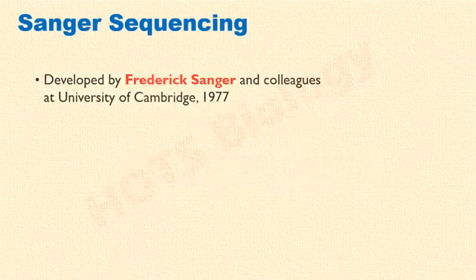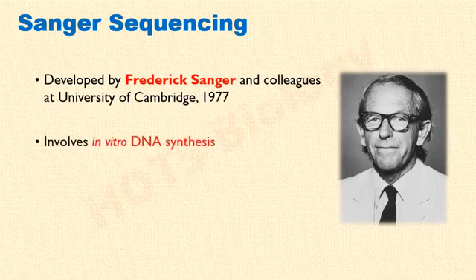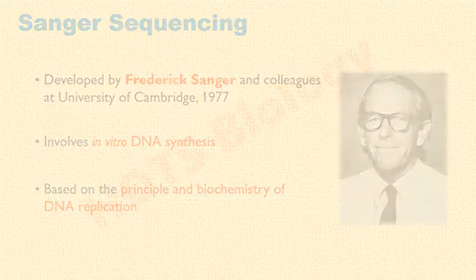Sanger sequencing was developed by Frederick Sanger and colleagues at the University of Cambridge in 1977. This technique involves in vitro DNA synthesis. It is based on the principle and biochemistry of DNA replication. Tell me, what will be the basic requirements for in vitro DNA synthesis?